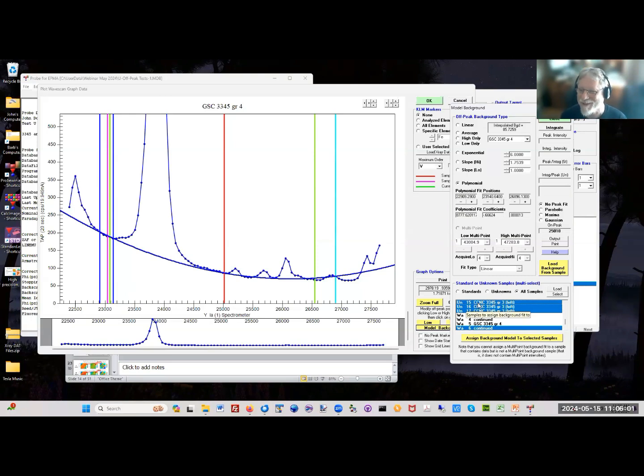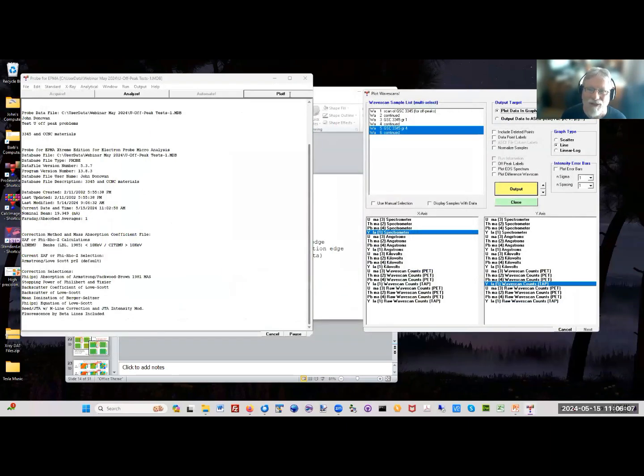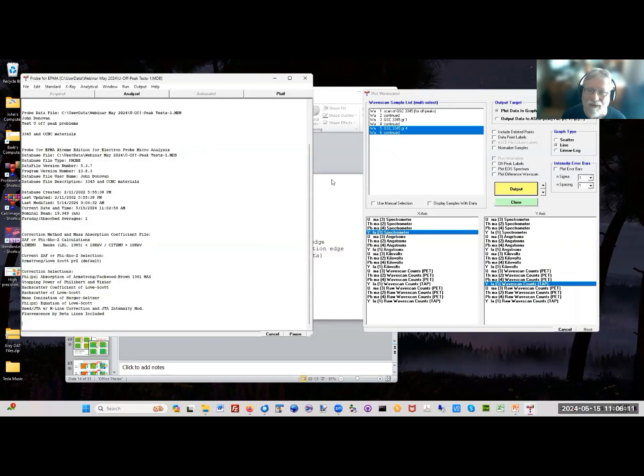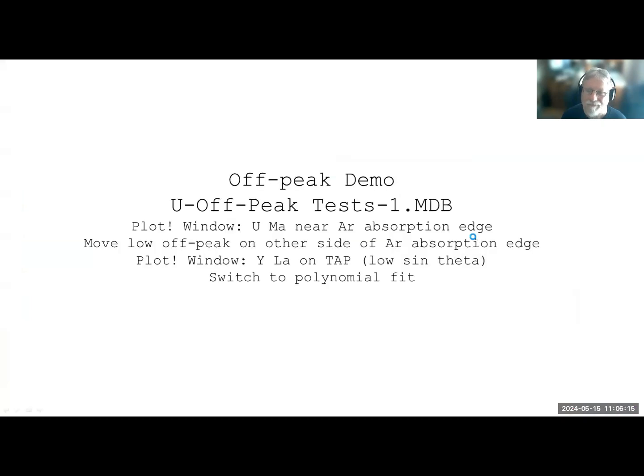Oh, I'm in my software, not PowerPoint, sorry. Yeah, you can assign it to these samples here. Okay, so let's continue. I'll just close this and go back to the presentation.